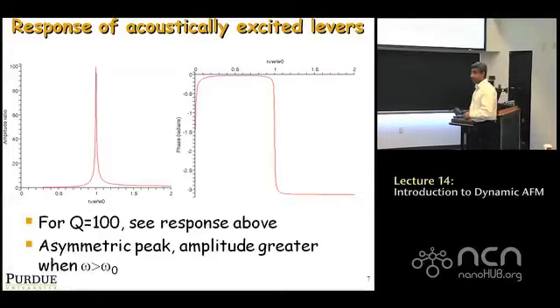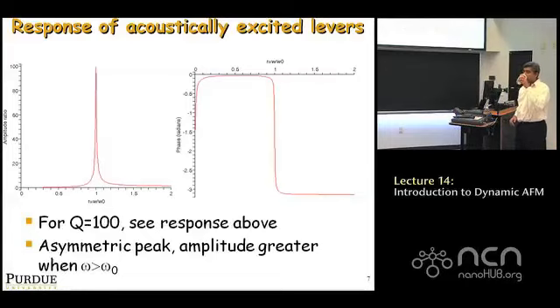Yeah? Could you comment on the phase? Because the phase is a theoretical phase. Yeah. Companies that make AFMs don't always print out the phase. Oh yeah. This is okay. Yeah, this is very important.